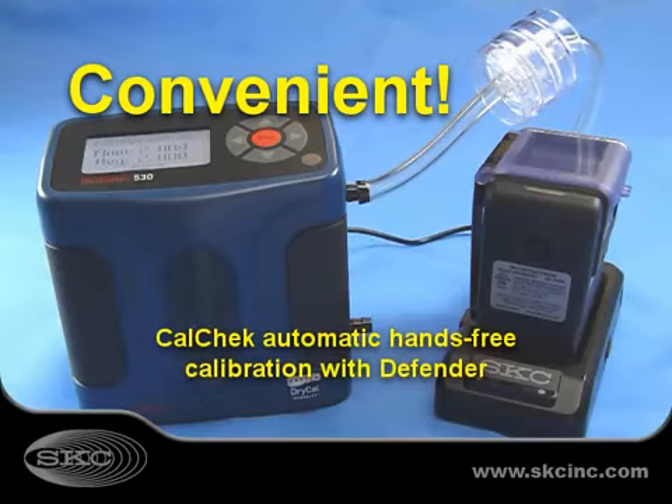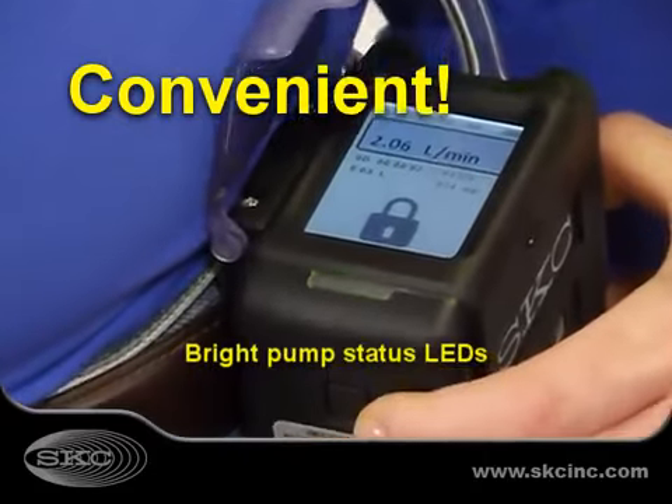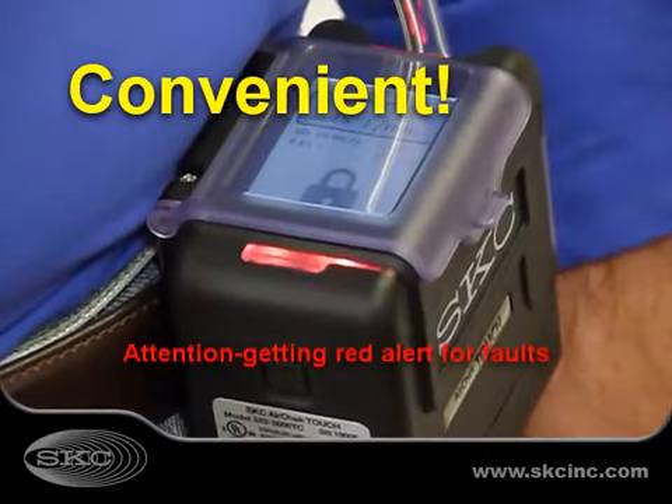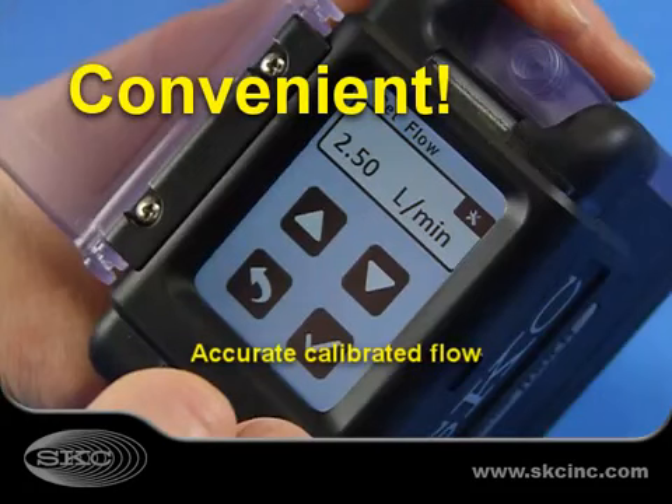With automatic hands-free CalCheck calibration, real-time display, and LED pump status indicators, AirCheck Touch offers the features you want while providing accurate calibrated flows.